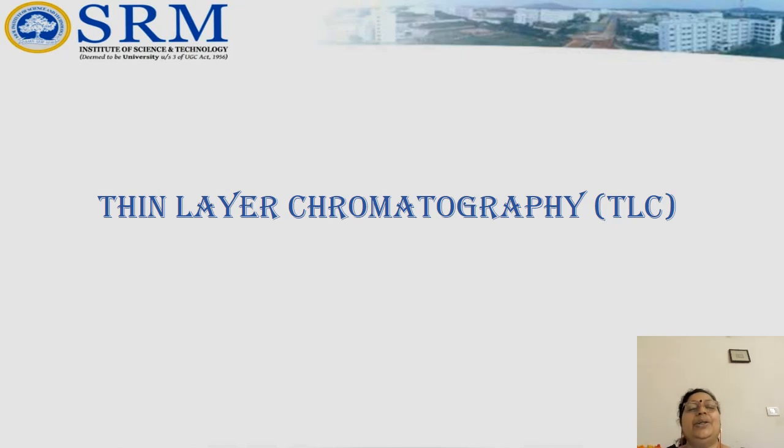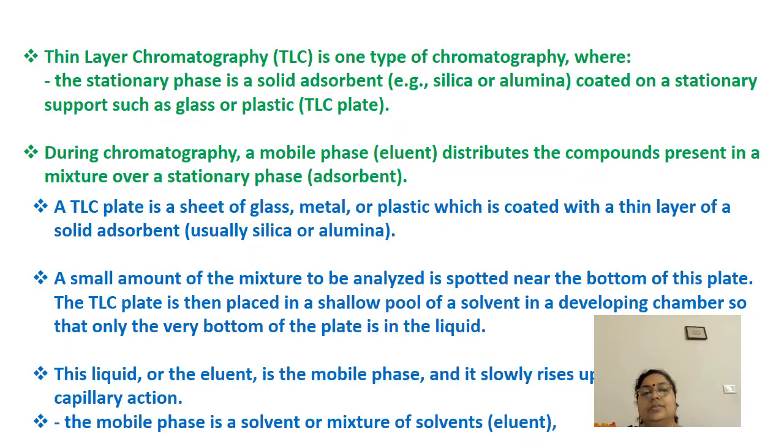Hello friends, today I am going to explain about thin layer chromatography or TLC. It is a rapid and simple chromatographic technique used to separate and analyze mixtures of compounds by separating them based on the difference in affinity towards stationary phase and mobile phase.